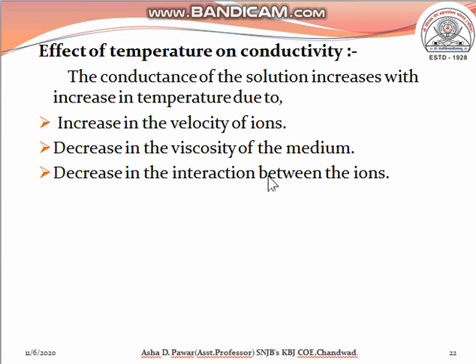So you know that the conductance is nothing but the reciprocal of resistance and its unit is per ohm. Okay, so if we increase or decrease the temperature, what is the effect of temperature on conductivity? The conductance of a solution increases with increase in temperature due to three different reasons.